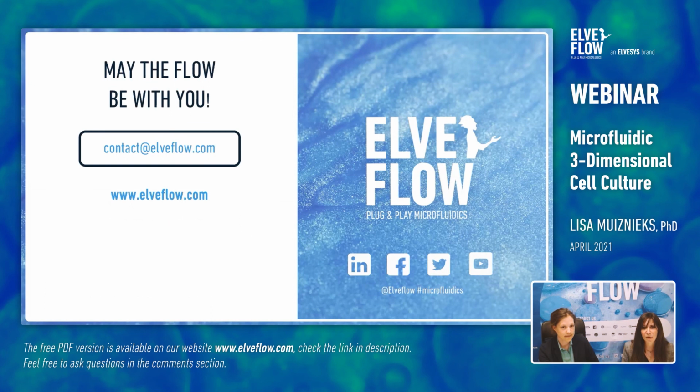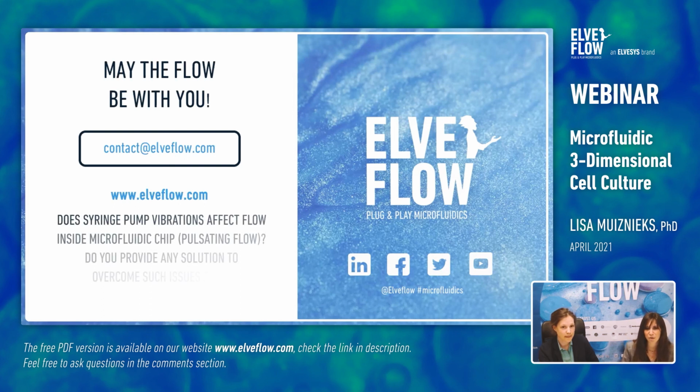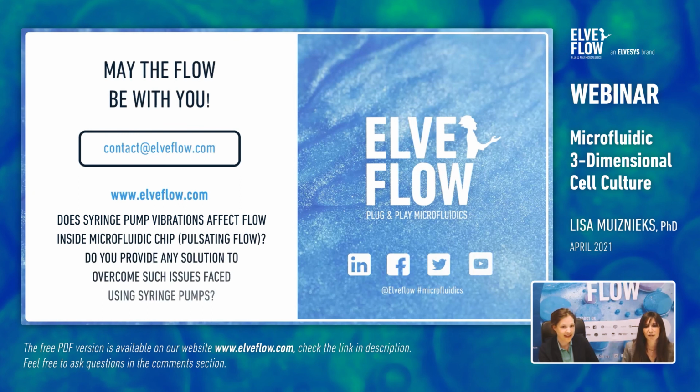Another question from Abhinandan. Do syringe pump vibrations affect flow inside the microfluidic chip, pulsating flow? And do you provide any solution to overcome such issues faced using syringe pumps? Thanks a lot for the questions. So actually, you're right, using syringe pumps, you may have this issue.